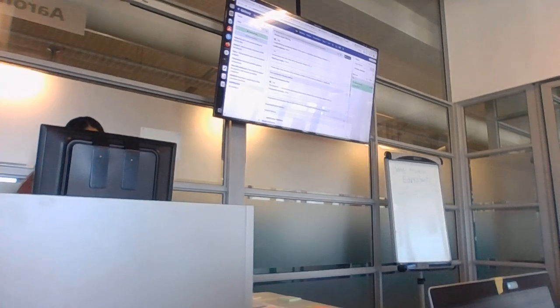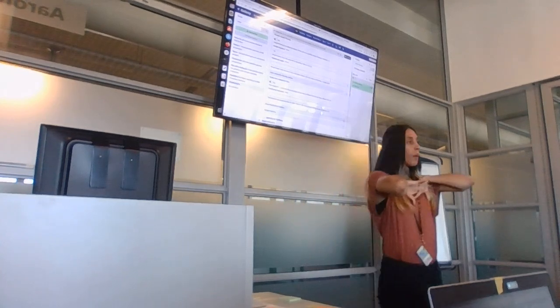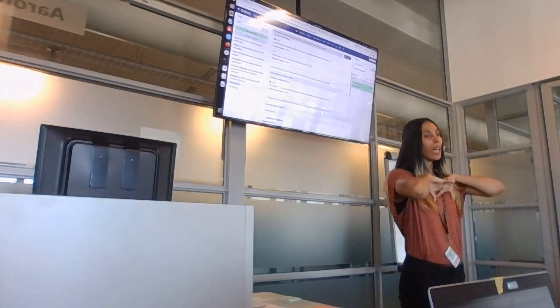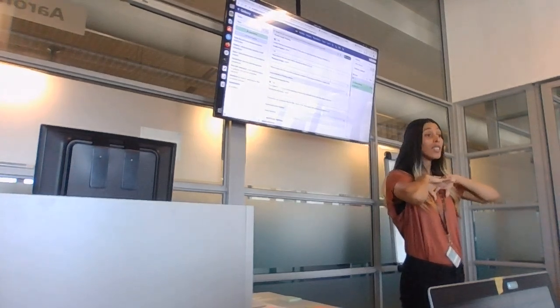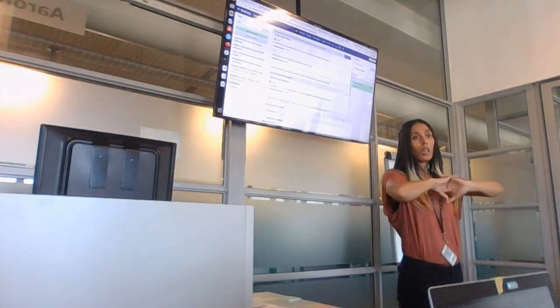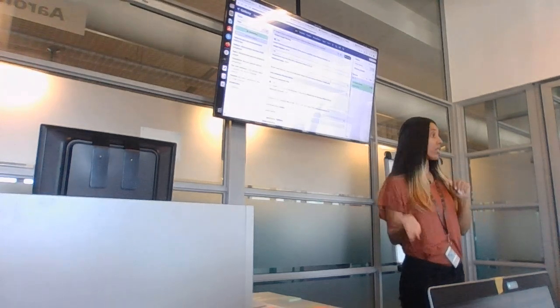And then a very important step. When you do bioinformatics, like I said, you basically have to plan what you're going to do. You can find the nicest tool out there, but then you require a tool after that tool.